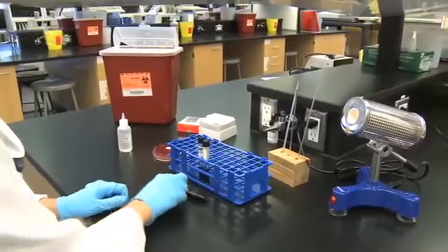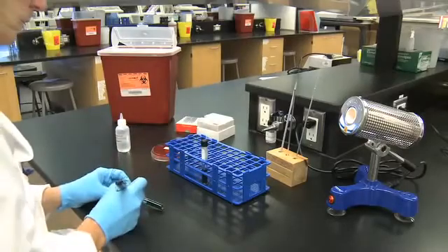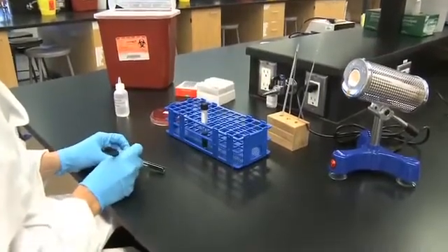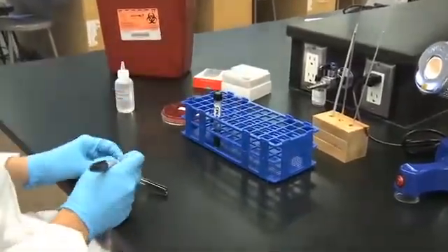Glucose oxidation and fermentation: label two tubes of medium for each organism to be tested. Mark one as closed and the other as open.